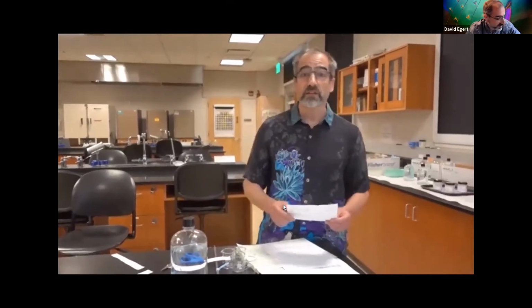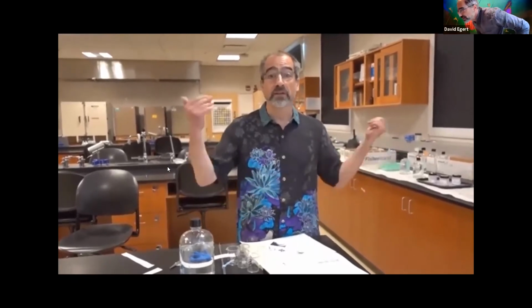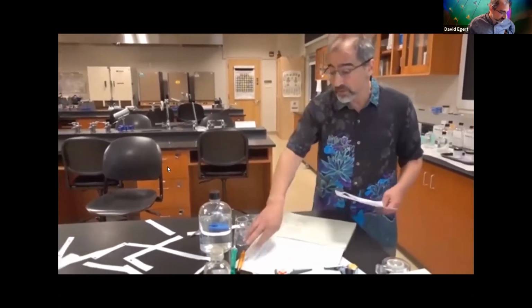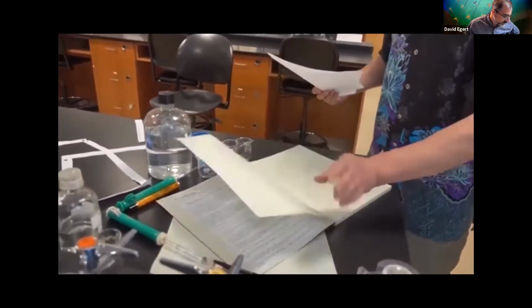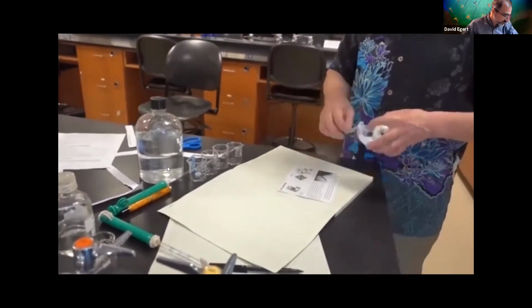All right, so now we're going to do parts 2 and 3 of the chemistry review lab. Parts 2 and 3 are very similar to each other. It's just part 2 is dealing with electrolytes, and part 3 is going to do the same basic steps, but with carbohydrate in this case. And just to give you a sense of the mechanics of putting the lab book together, here we have data from the last part of the lab, probably leave a little space to write up, but then we're going to have the instructions for part 2 here for electrolytes.